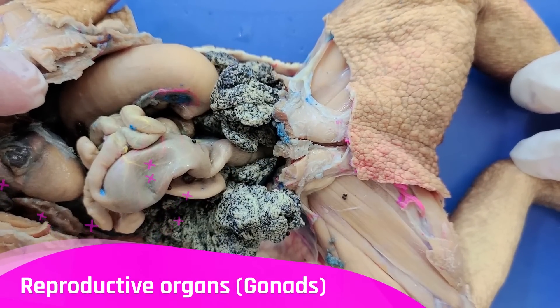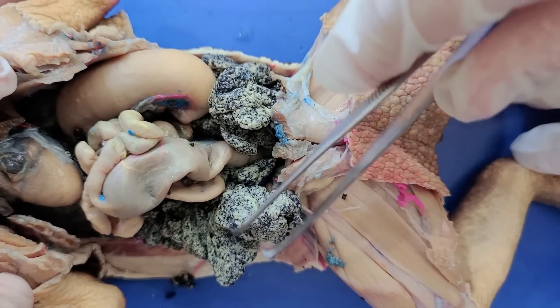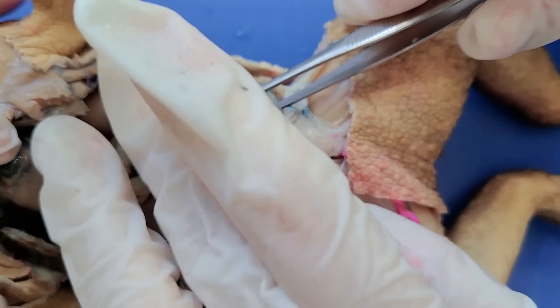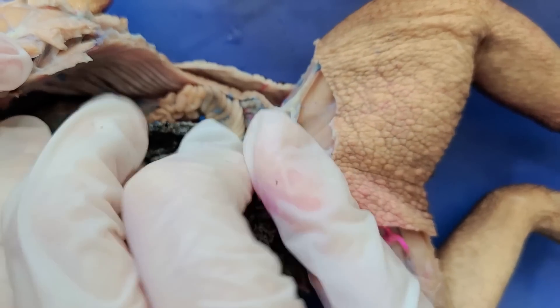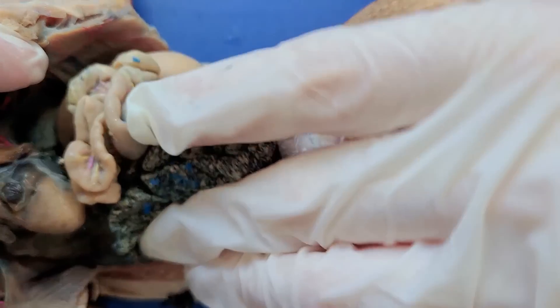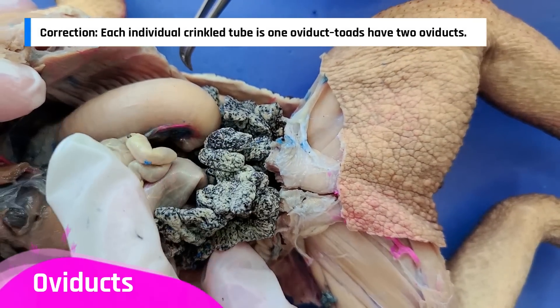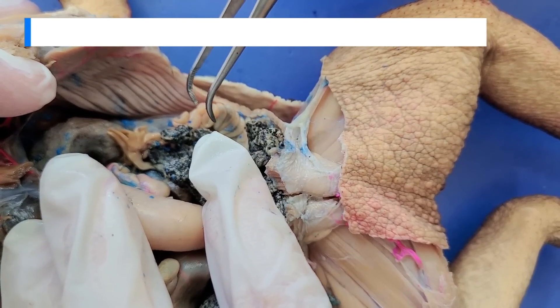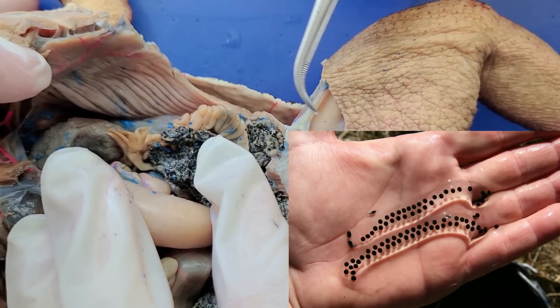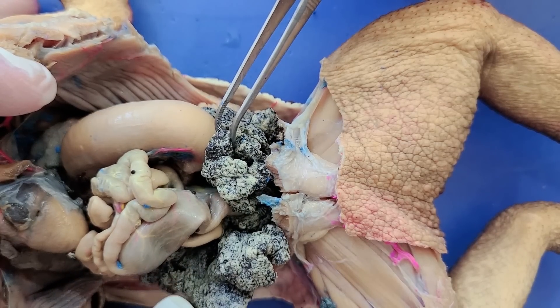Now let's look at the reproductive organs. This toad is female, which you can tell by all this black and white mass here, which are the eggs filling the ovaries — so this is where eggs are produced and stored. You can also see this crinkled structure here and its counterpart on the other side. Combined, this V-shaped structure is called the oviduct, and it's responsible for secreting the thick, jelly-like substance coating toad eggs. In toad eggs, fertilization happens externally — the female lays her eggs in the water, then the male comes and fertilizes the eggs with his sperm.